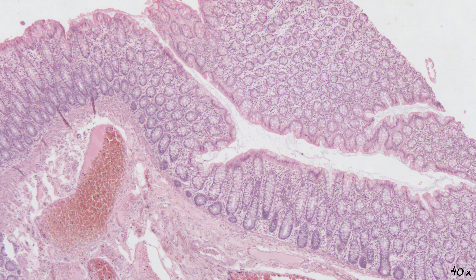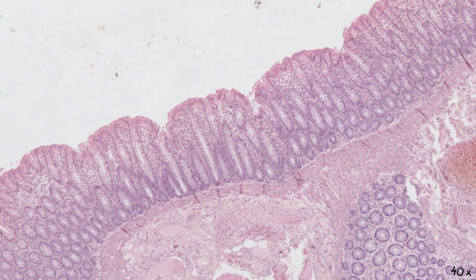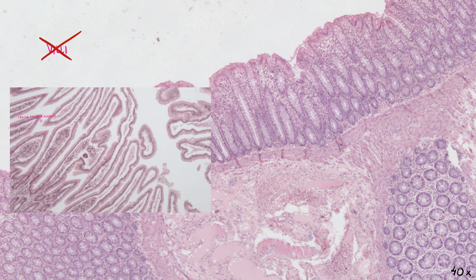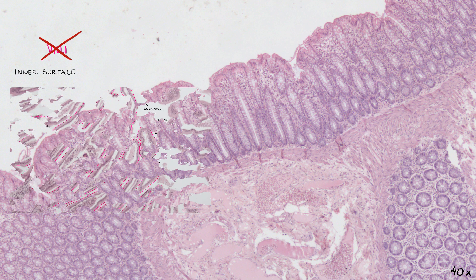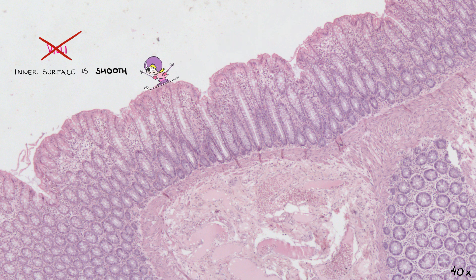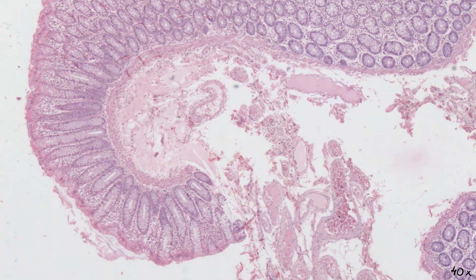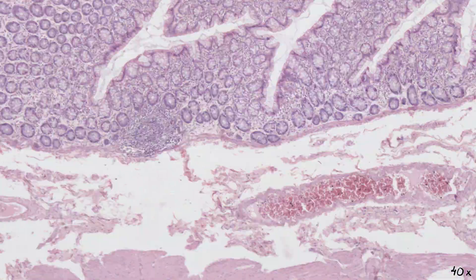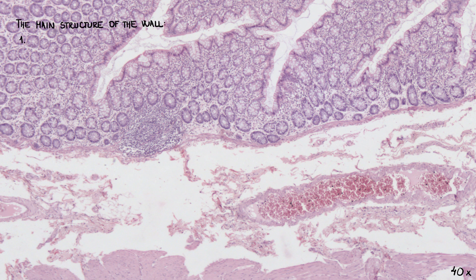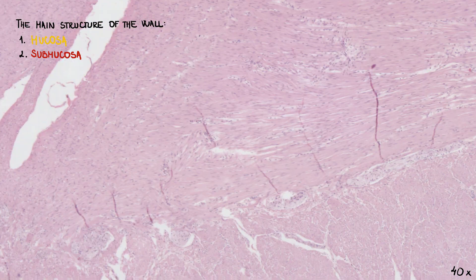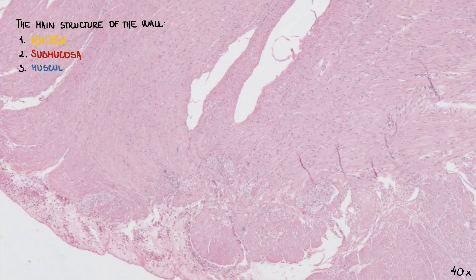The second important difference from the small intestine is the absence of villi. Thus, the inner surface of the large intestine is smooth. The main structure of the wall consists of mucosa, submucosa, muscularis, and serosa.